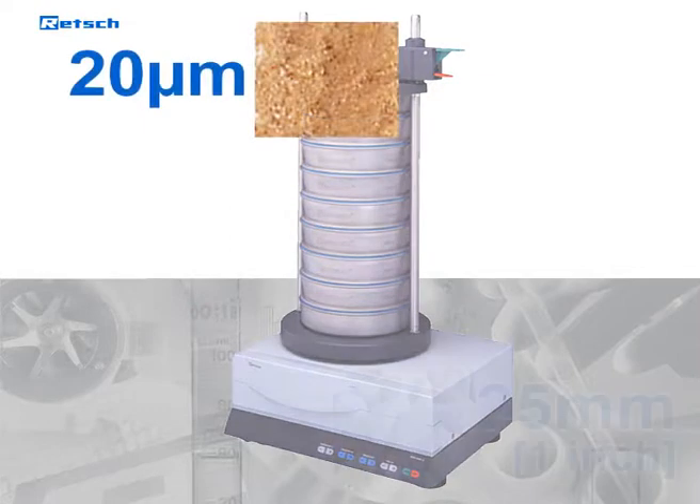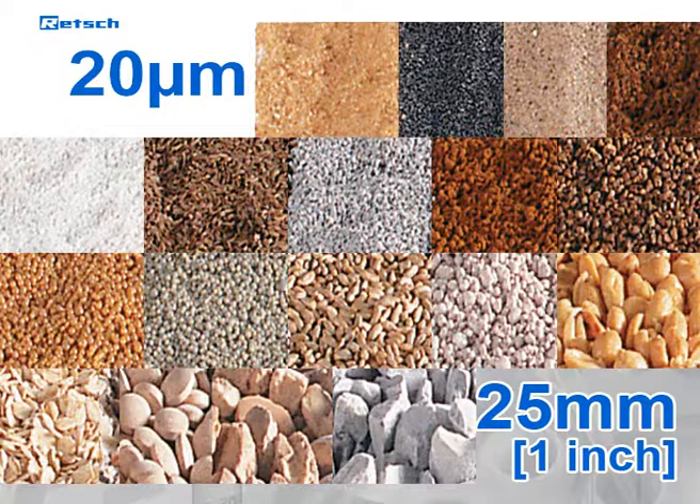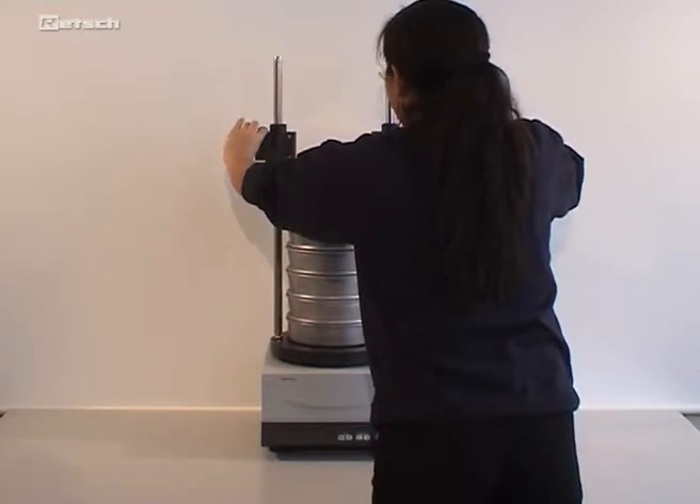Particles between 20 micrometers and 25 millimeters can be analyzed with the AS200. It is also suitable for wet sieving. The comfort sieve clamping device enables easier, faster, and safer handling.